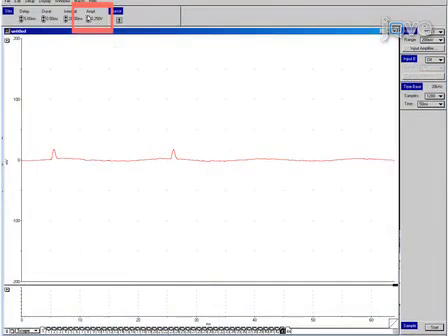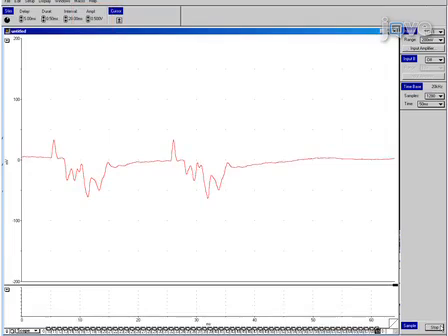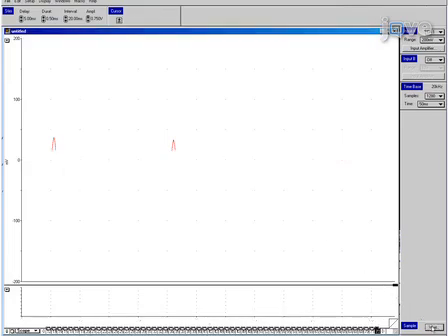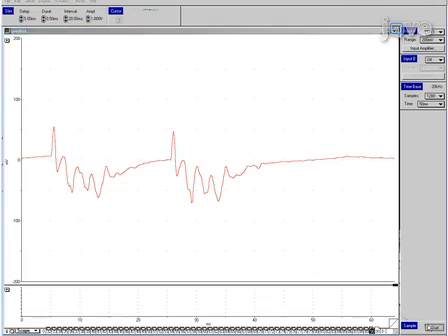Slowly decrease the voltage using the tab at the top left of the screen. The action potential should become smaller in magnitude until its characteristic wave pattern disappears. Decreasing the voltage reduces the number of neurons that are recruited to contribute to the compound action potential. To reverse the effect, incrementally increase the voltage. As more neurons are recruited, the compound action potential wave grows larger.